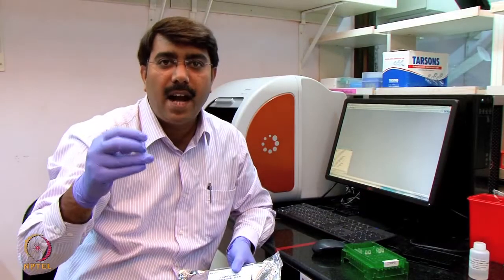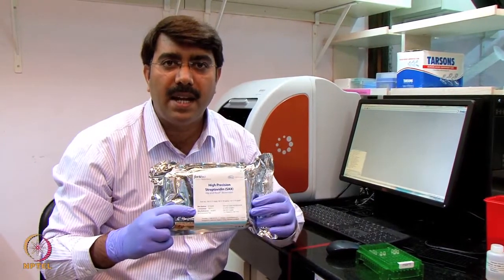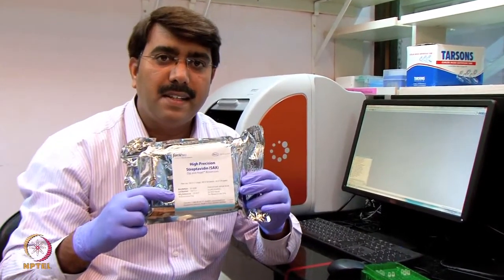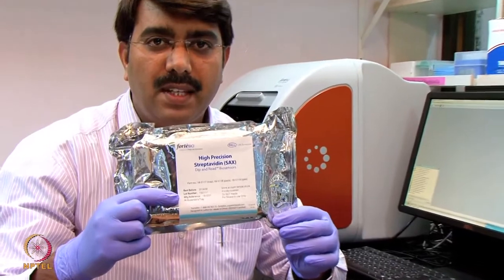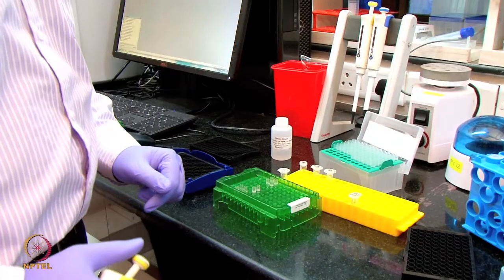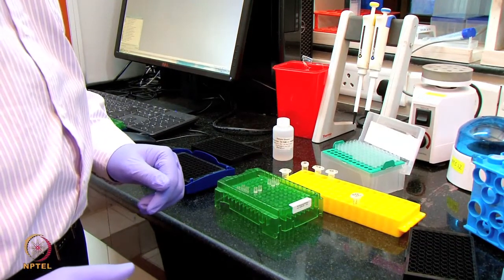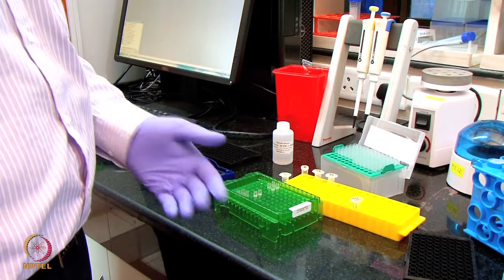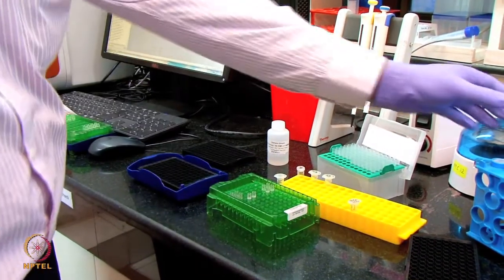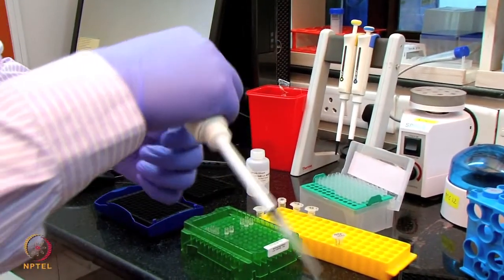The biotinylated antibody, I am going to use for immobilization of the antibody onto a streptavidin sensor. This is the streptavidin sensor I am using for the immobilization step. So here in this experiment, we are using a streptavidin sensor. The streptavidin sensor has to be hydrated prior to the immobilization. Now I am going to do this hydration of the streptavidin sensors.